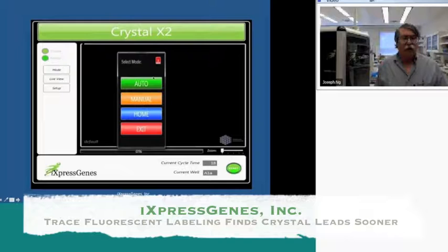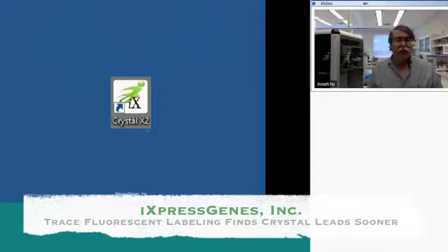And the other main screen, not much to see on this, is by going into the mode switch. We have the auto mode, which is what we normally collect our data with, and manual mode, which we use for, as it says, manually adjusting the position and the focus and the light intensity. The home mode basically homes the stages and only has to be done whenever the box itself has been turned off or turned on, one time only, and then exit, which should be fairly self-explanatory.